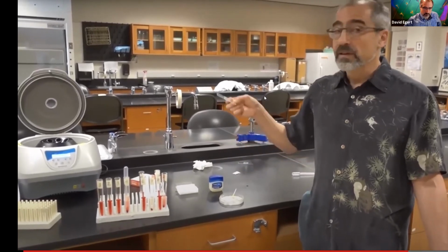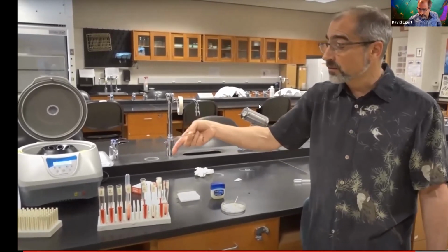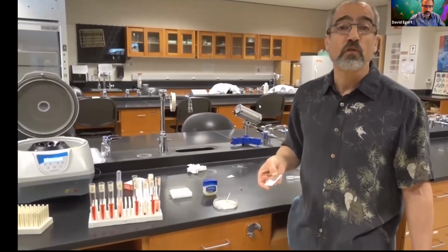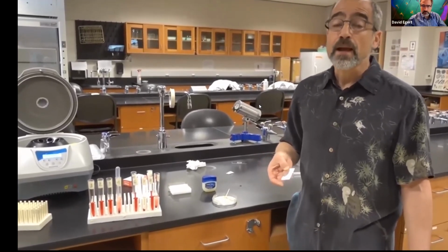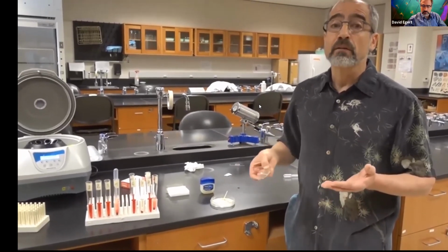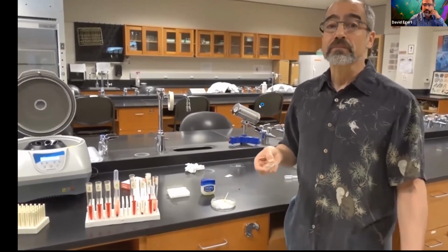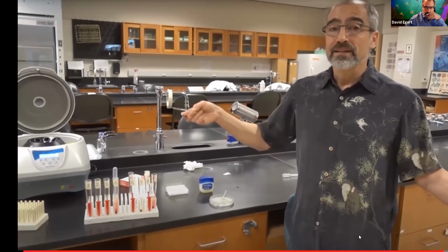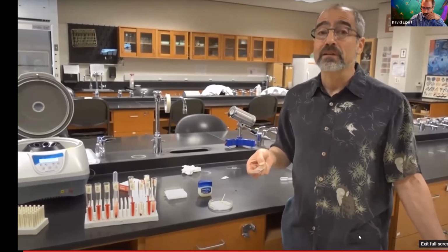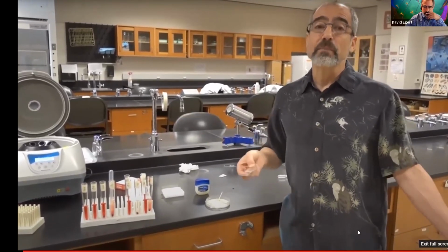And this is what you would do for a variety of the conditions we talked about in the lab. You'd look at test tube 1, test tube 3, test tube 4, test tube 5. You do the same process for each of those, and compare and draw. For our online version, we'll show you pictures. But this is the only way you'd really know what really happened to the blood cells, particularly if they didn't lyse.